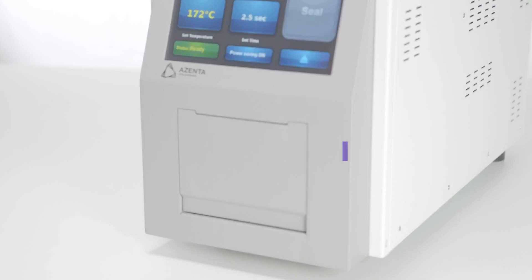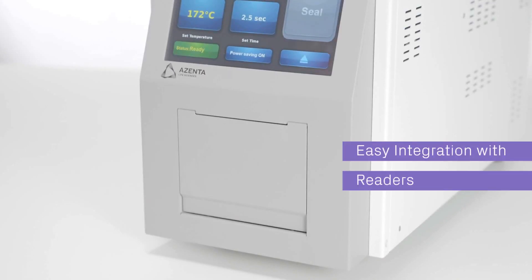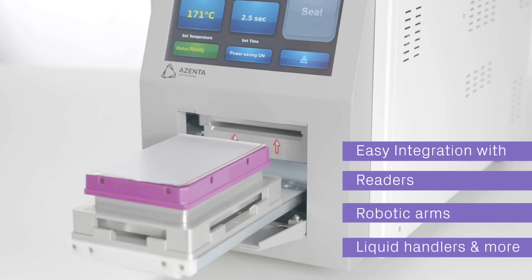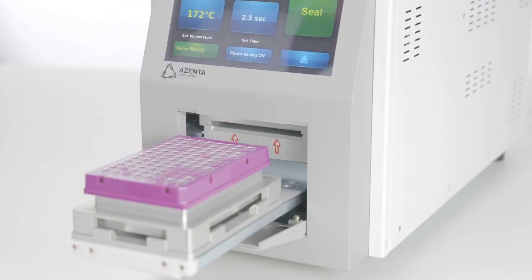Sealing up to 5,000 plates without manual input, it integrates easily with readers, robotic arms, liquid handlers, and other instruments — delivering a custom automated system without the cost and hassle of custom drivers.